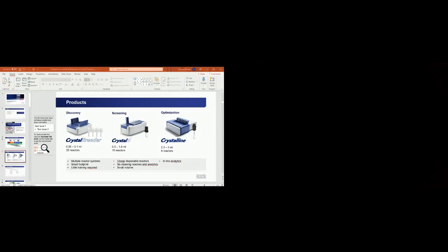As you look at databases of what co-crystals exist, you start to get an idea of, as I showed with the synthons, what bonding motifs are consistent, what keeps reappearing. Yeah. If you see that in your molecule, you go, okay, that could potentially be somewhere someone could come in. But the modeling isn't at the stage where it can do that yet. Yeah. In the same way you can't predict the number of polymorphs or solubility. But it's getting there.